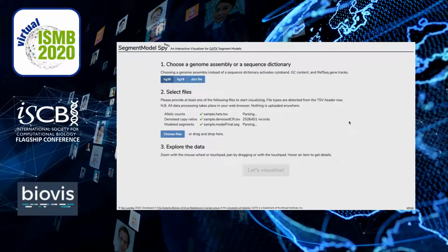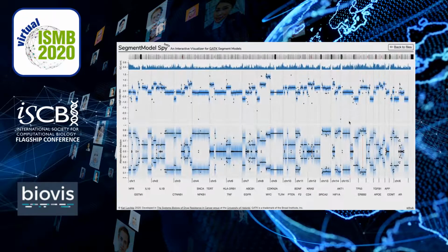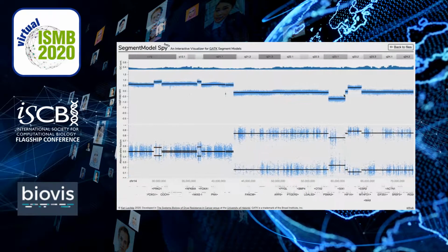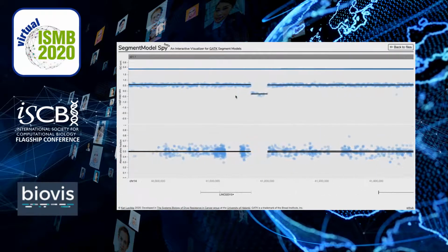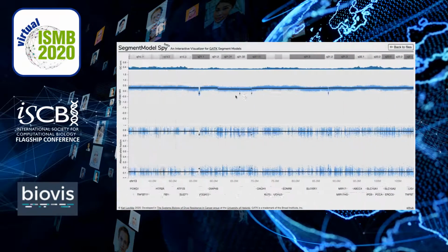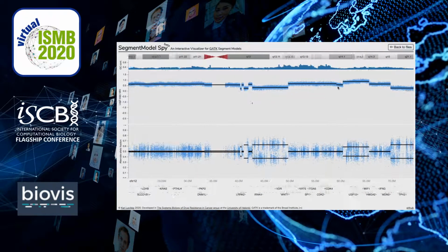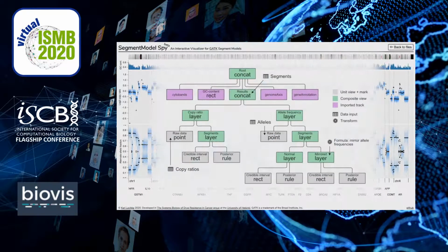This dataset consists of about 4 million raw data points, shown in blue, along with the modeled segments, the black lines. The user can see a genome-wide overview and zoom into details to see the breakpoints more clearly. Continuous zooming and panning allows the user to scan the results swiftly. Thanks to the GPU, the interactions are fast and smooth. The grammar allows for specifying a complex view hierarchy, involving concatenation and layering.